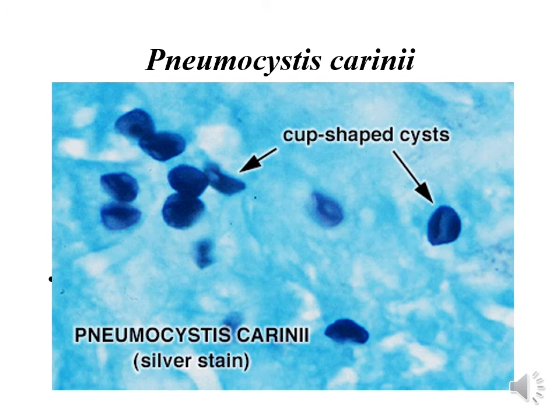Pneumocystis carinii can cause pneumonia. Usually, to see the cyst of this parasite, you need a special stain, and here we have what is known as silver stain. And usually, it is just a cup-shaped cyst, not much to see inside, maybe just something known as sporozoites.